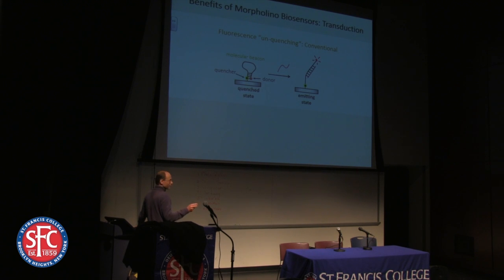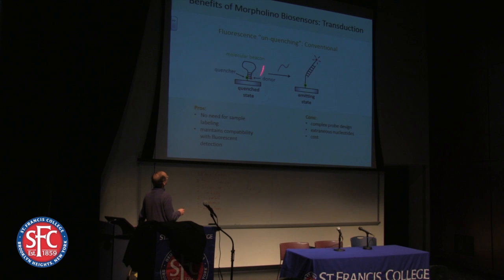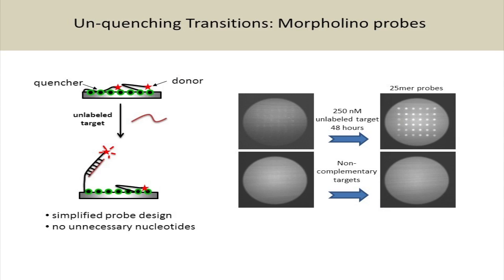Also now, if you have these molecules that really like to stick to the solid support, you can ask, can I use this somehow to do some kind of innovative detection approach? So one idea that we got turned on to by the way people use molecular beacons is label-free fluorescent detection. Sounds like a contradiction of terms, but you detect unlabeled sample by using fluorescence.